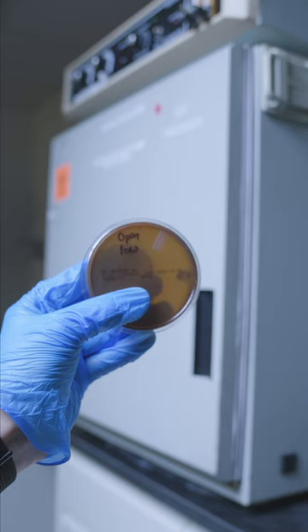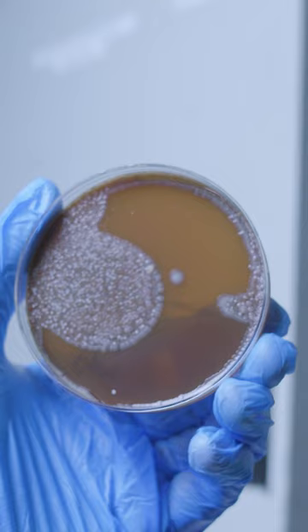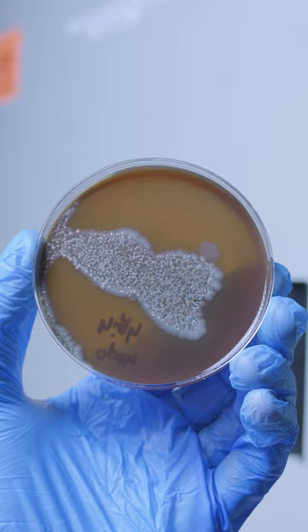So the first result is going to be with the lid open at 20 inches. I don't know what that is, but I know what that is, and it's gross. Now with the lid open at 30 inches — not as much as the first one, but still pretty bad.